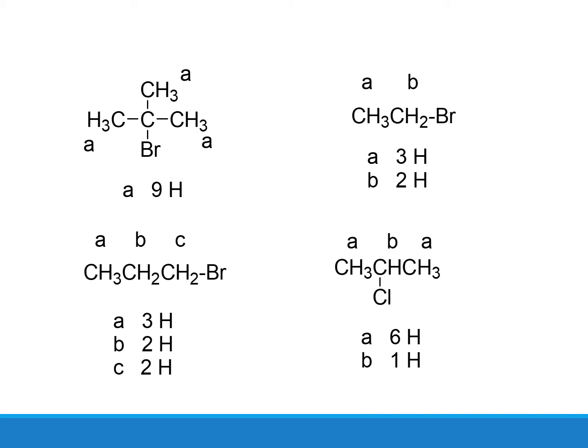So the ratio is one intensity unit higher for the methyl peak than for the methylene peak. It's just the same thing for the other examples you see below these exercises.